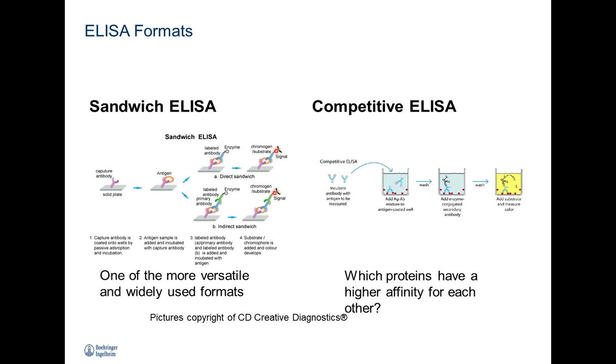So in this type of format, one of the antibodies will be coated down onto the plate. Your sample will be added, with an additional incubation. Then your second matched antibody is applied, and then your labeled secondary. The key advantage to a sandwich ELISA is a high sensitivity, and it can be 2 to 5 times more sensitive than a direct or an indirect ELISA.